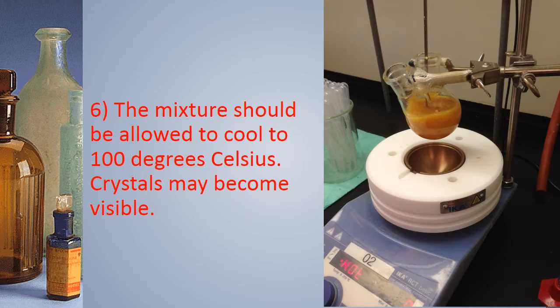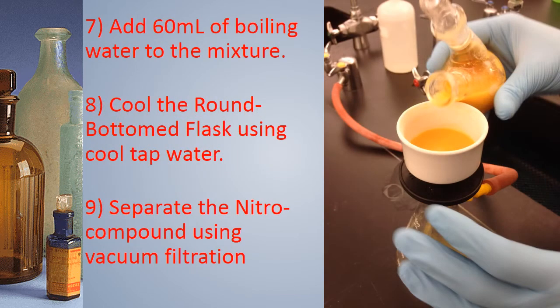The mixture should then be allowed to cool to 100 degrees Celsius and crystals may become visible. We then add 60 milliliters of boiling water to the mixture. We cool the round bottom flask using cool tap water and separate out the nitro compound using vacuum filtration.